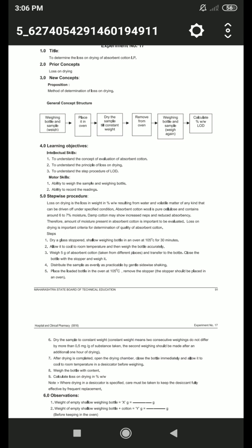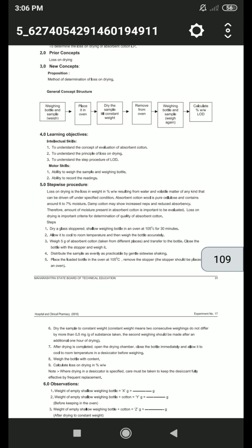They are either soluble or insoluble substances that absorb water due to their chemical properties. Examples include silica gel, bauxite, calcium sulfate, and montmorillonite clay. Soluble agents include calcium chloride and glycerin. These are the desiccants used in the desiccator.